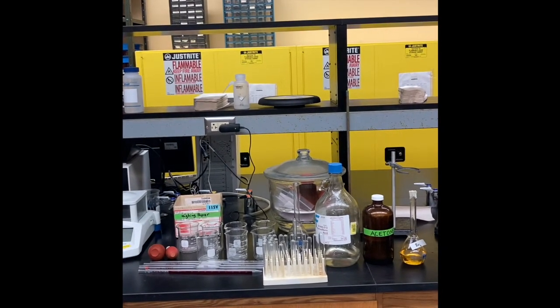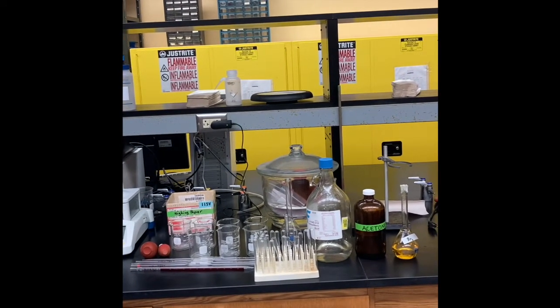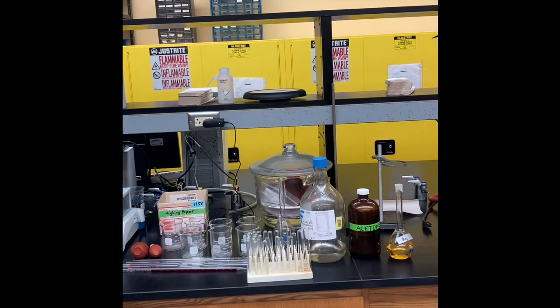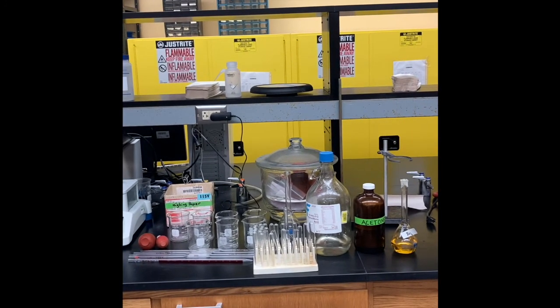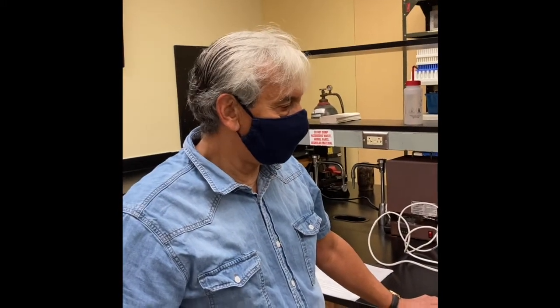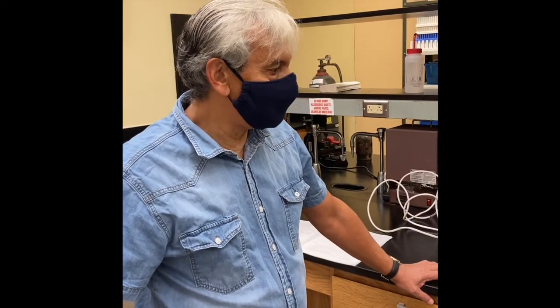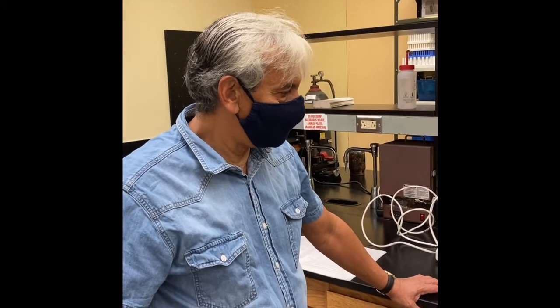In the first 4 solutions, we add a fixed amount, 10 milliliters, of acetone solution and different amounts of hydrochloric acid. In solutions 5, 6, and 7, combined with solution number 1, there is a fixed amount of hydrochloric acid and different amounts of acetone. In such a way, we have 4 solutions which have constant concentration of acetone and different amounts of hydrochloric acid. And in the same way, we have 4 different solutions with a fixed amount of hydrochloric acid and different concentrations of acetone.